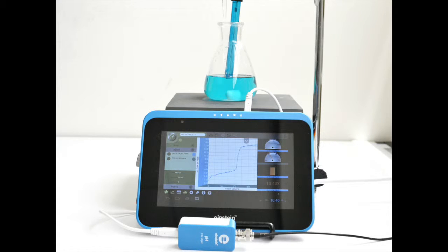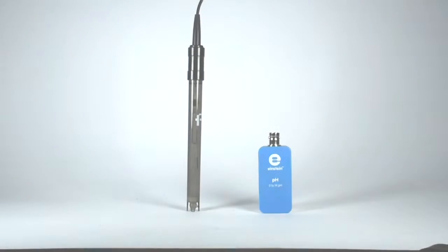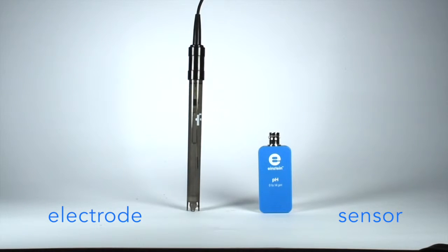Measuring pH is a key part of many chemistry experiments. The Einstein pH sensor has two parts, the sensor and the electrode.